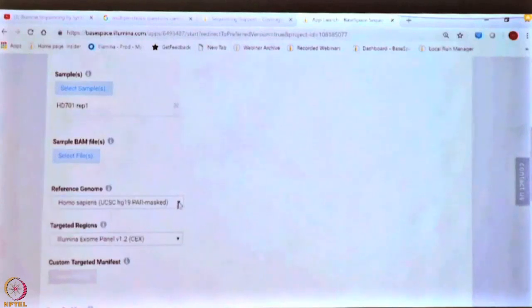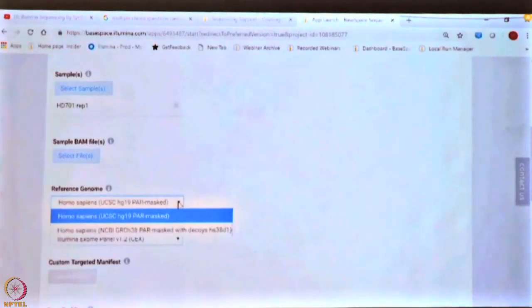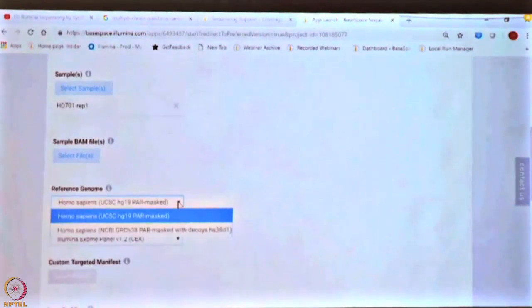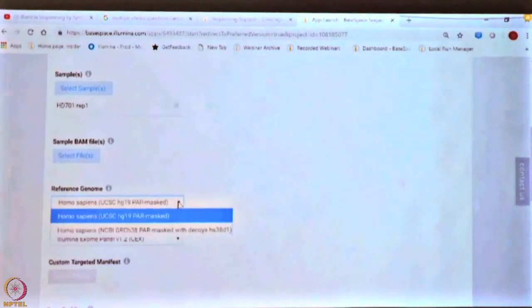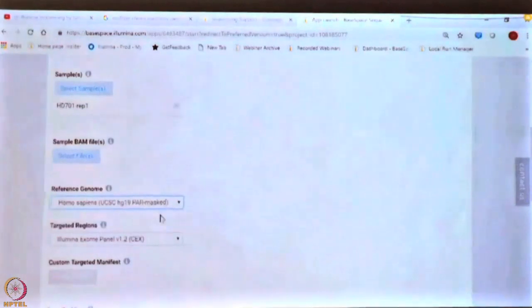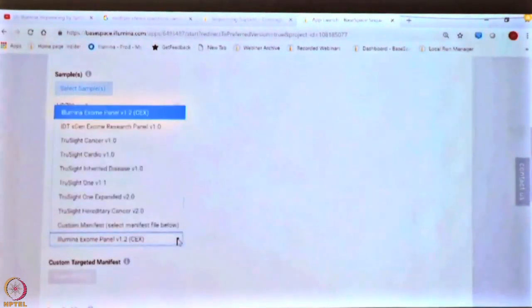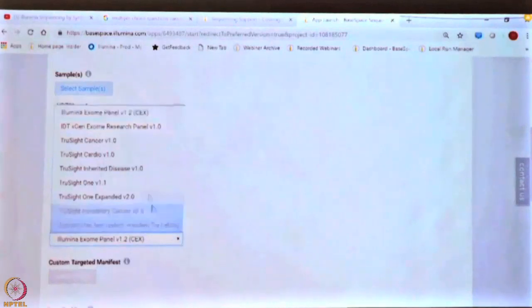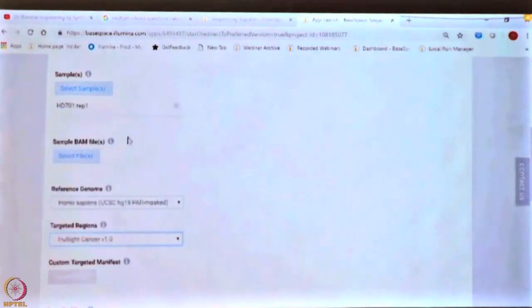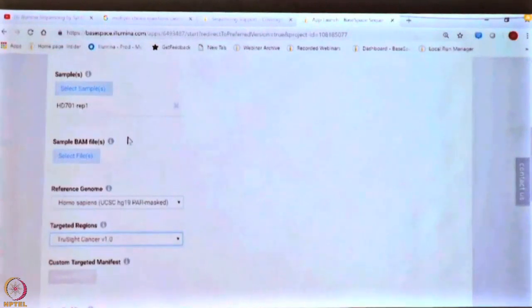There is an analysis name field where you give a unique name to your analysis. By default, it will save results to the same project from which you picked up the input data files, but you can save it somewhere else if you want. You can go to the project and select any sample you want to run. If there are BAM files — which are aligned data files generated by aligners — you can select those. You also select the reference genome, because you have to map the read data back to the reference genome. In this case we are dealing with human genome data, so we map to the human reference genome. You can also choose the targeted panel that was used.